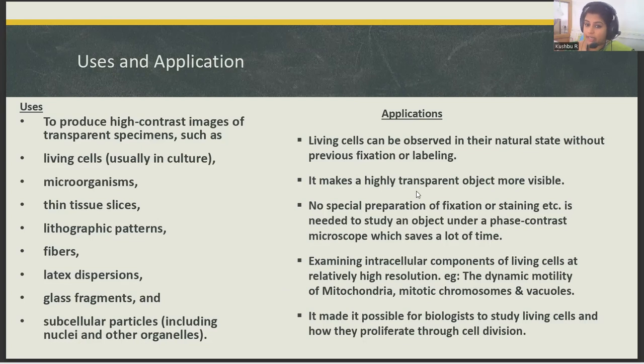Here, highly transparent objects are visible so that internal detailing is done. It has very good resolution. Dynamic motilities can be studied. All the metabolism can be studied. Movements can be studied.